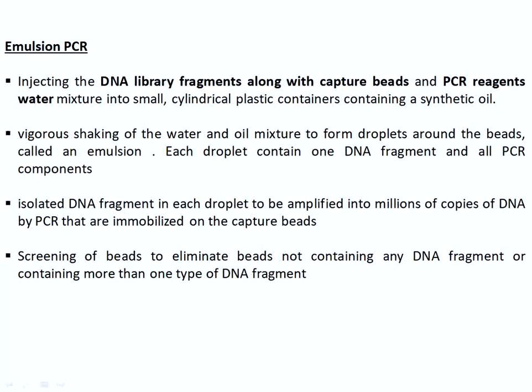After the beads are loaded with DNA fragments, this DNA library fragment along with the capture bead is then subjected to emulsion PCR.